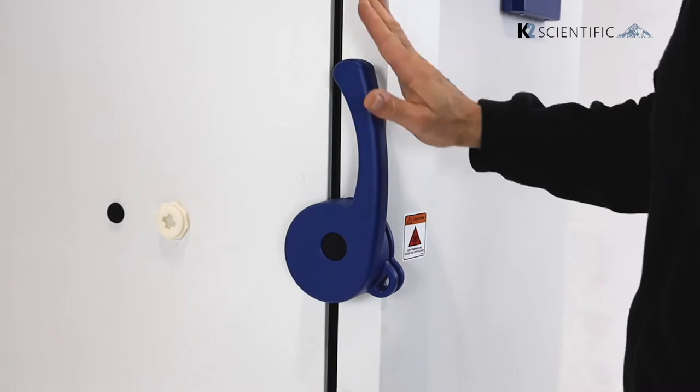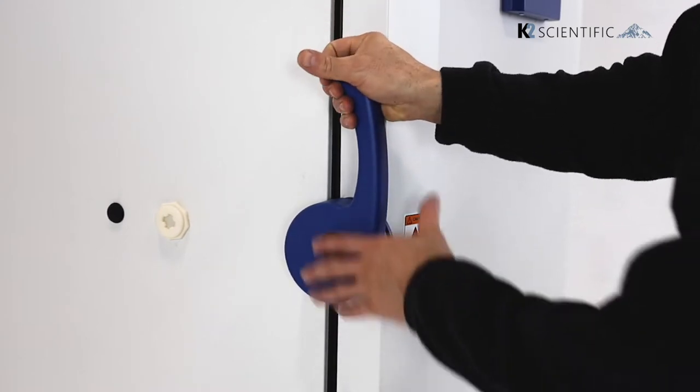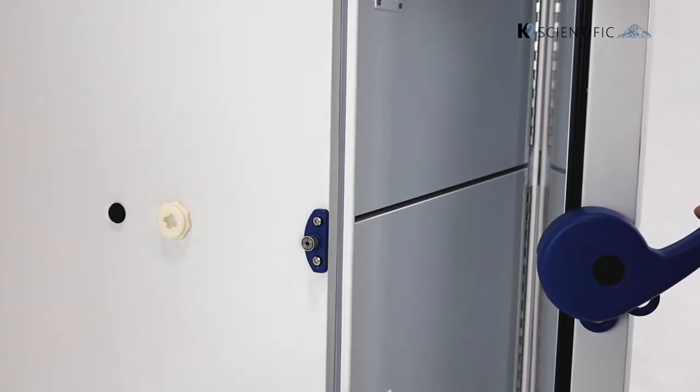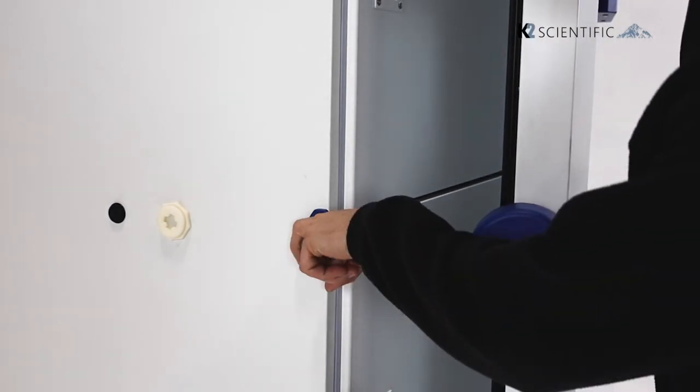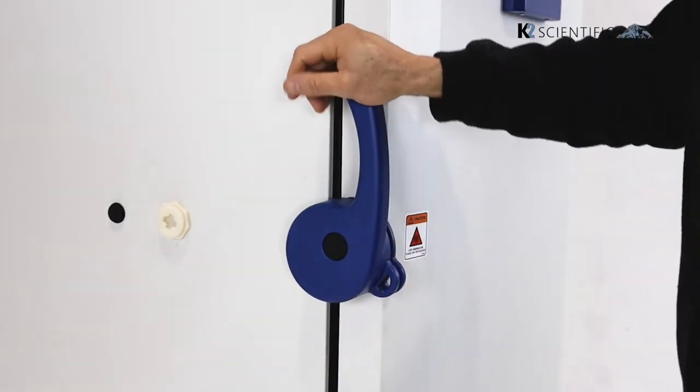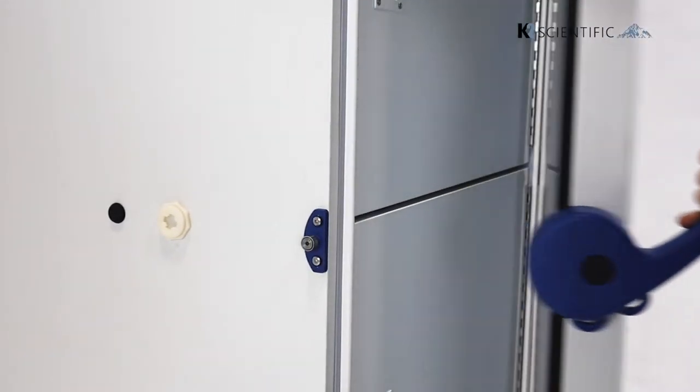When it's standing straight up, this is in the locked position. To open it, you pull the door handle down. There's a latch on the inside that rolls over this post that closes and opens the door.